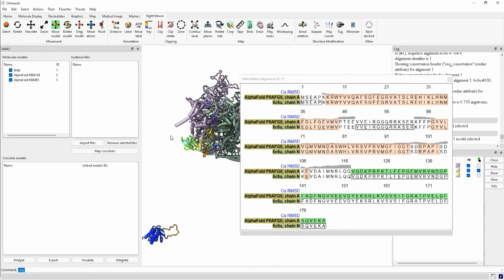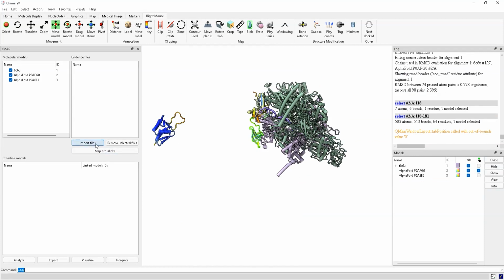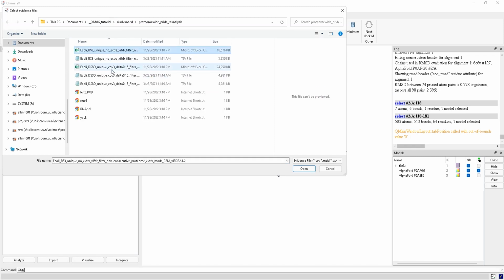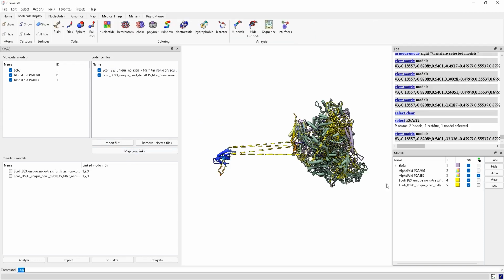And we will see whether it makes sense to have the full structure or not once we start to map the crosslinks. So now we import our crosslinking table from this huge experiment. Remember that we are almost trying to match 80,000 different lines, where we need to align every single peptide sequence. So I will hit the map crosslinks button, but it will take a while. Here we go. It was done in just a bit over 2 minutes.